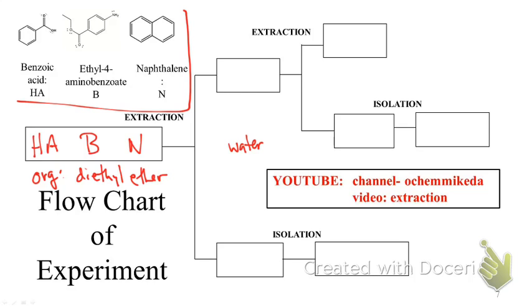Okay, what's that something else? Is there any chemistry that I could take advantage of in those compounds? Say acid-base chemistry, where acid begins with A and base begins with B. You can do either one, right? Okay, pick one. Acid. If we add acid, what's your favorite acid? HCl. So we add HCl.